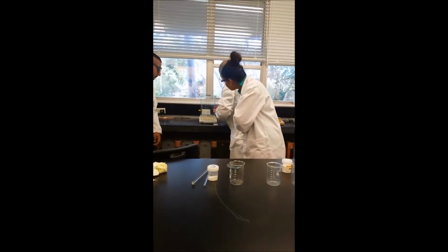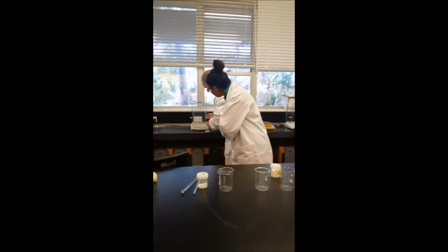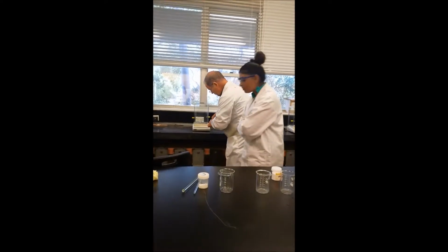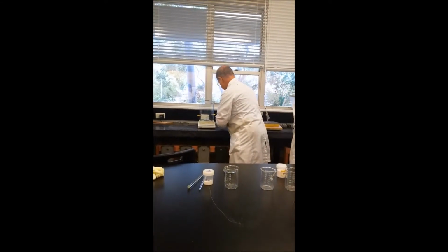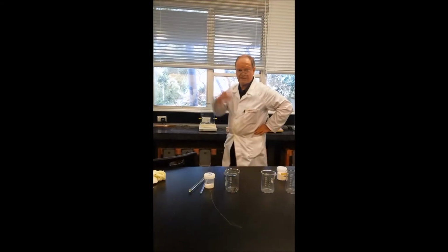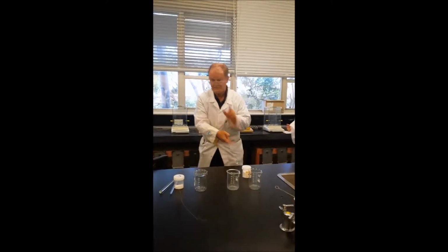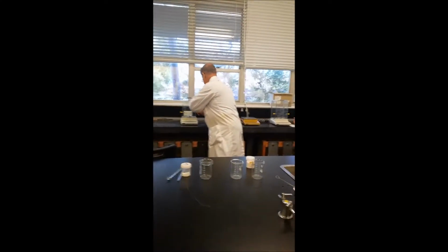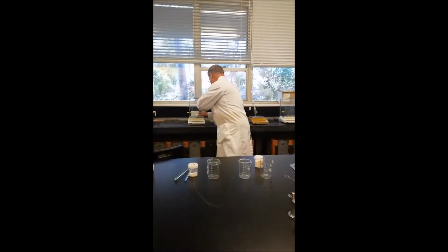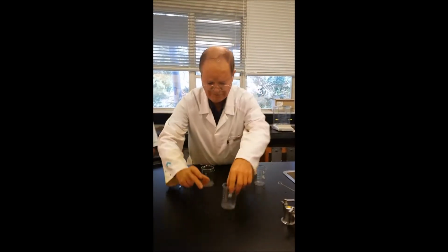Okay, now I've actually put too much out. But that's not going to worry me. And the reason it's not going to worry me is whatever's left behind gets left behind in the beaker and then we rinse it out. In most cases, even if we weigh it the right amount, we won't be able to get it all dissolved. Okay, so that's that one.